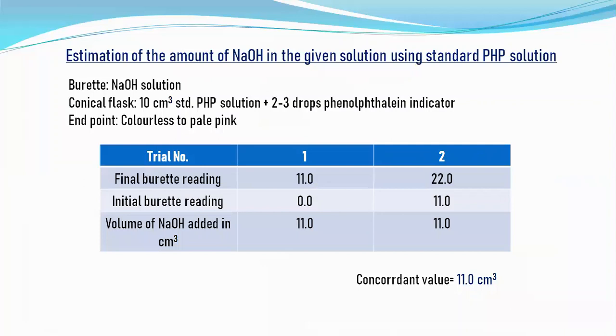So now using the concentration of this known PHP solution, we are going to find the molarity of the given NaOH solution. So this is done by titration experiment.